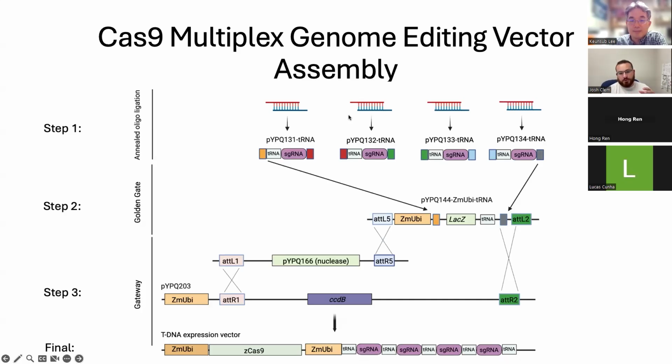Because the strains that we often replicate plasmids in, such as DH5 alpha, are recombinase mutants, so you're unlikely to observe any form of plasmid structural rearrangement or recombination. However, when you take that out and you're ready to transform your plant, you put it into Agrobacterium. Those are more susceptible to plasmid rearrangements. And that would be one reason to avoid using so many repetitive sequences, in fact, that might be one of the main reasons.